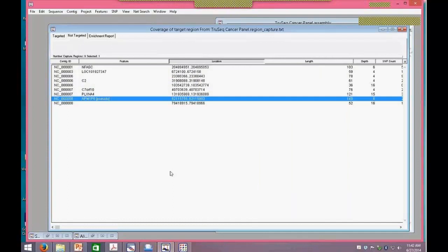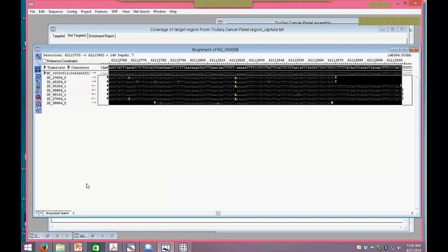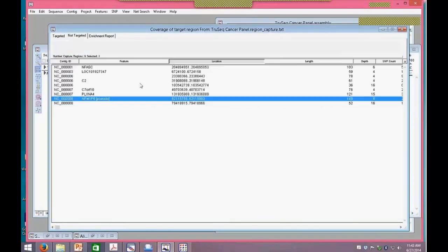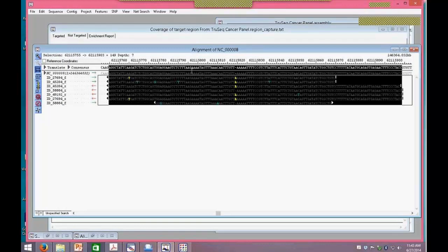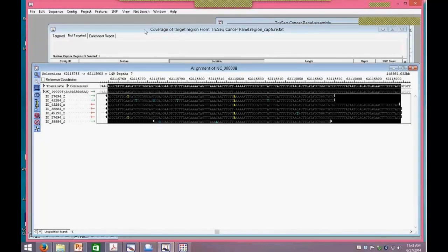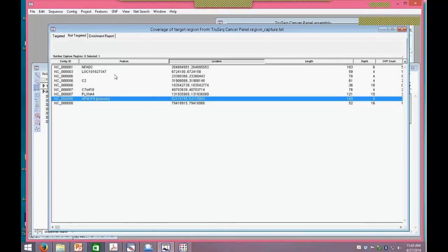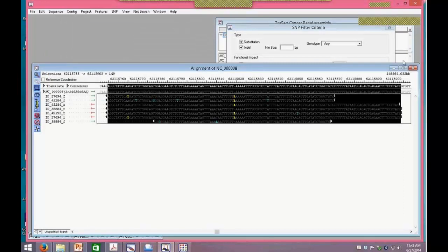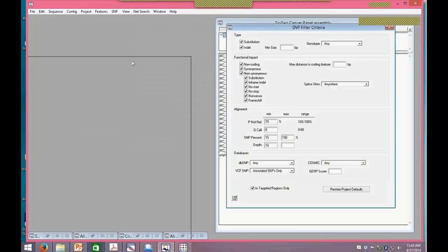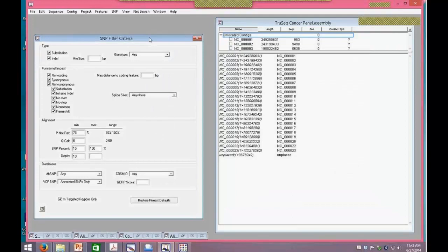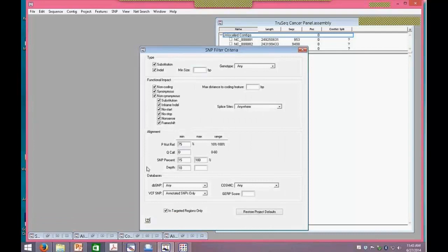We can see reads that weren't specific to the target and landed in pseudogenes. I've seen custom data sets where the targeting was not very specific and you get a whole list of pseudogenes, then you have to go back and adjust the primers and probes to get more accurate targeting. The new SNP filtering lets us apply multiple filters and really narrow down our focus on the targeted areas to find those SNPs of interest.